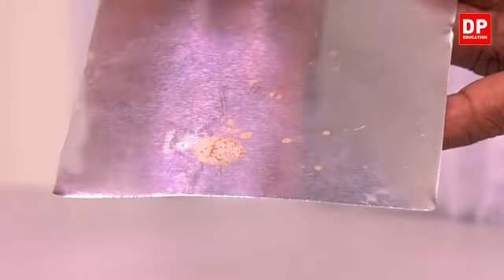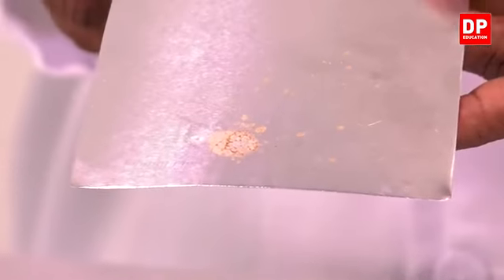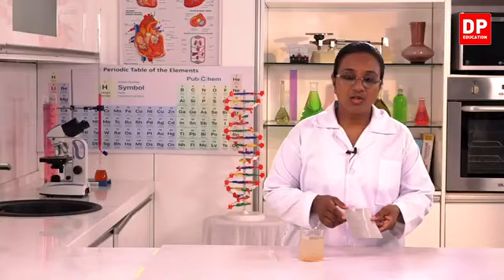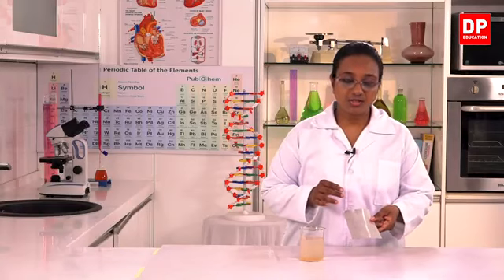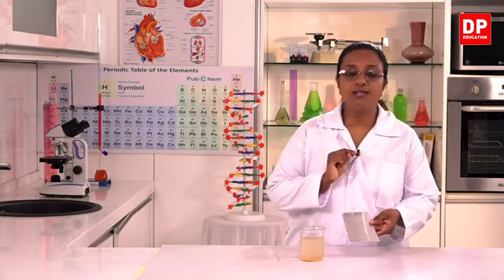There are no soil particles here. Whereas in this side, the drop I took from the bottom of the mixture, you can see there is a small amount of soil particle remaining there. So, from this observation, there are particles of soil here, there is nothing on this side.